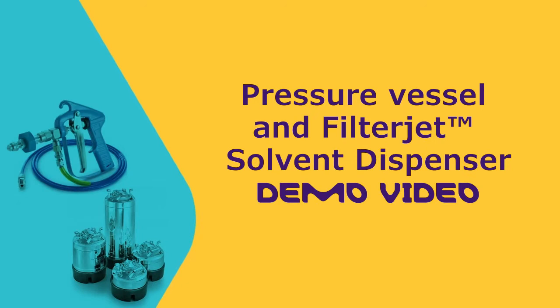For the application shown in this video, you will need to obtain the following items to build your pressure vessel and filter jet solvent dispenser setup.